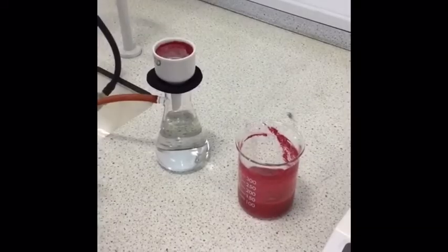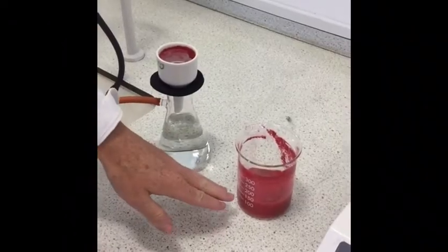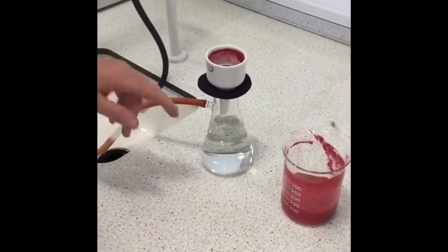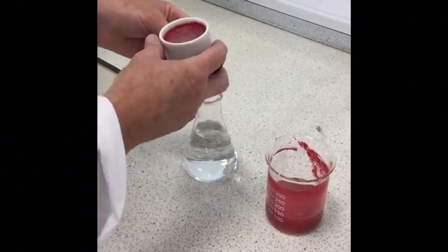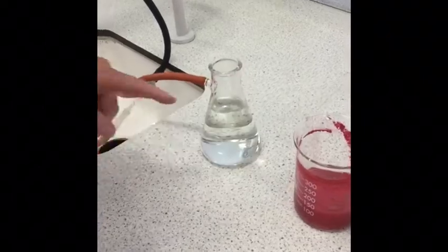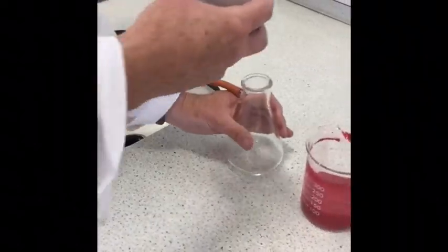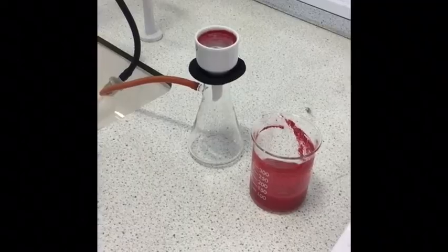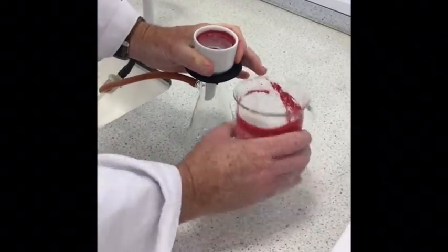Right, I've just stopped the filtration just now because I'm not going to be able to get all this solution into this flask before it's full up. So I've turned the tap off and removed the funnel, and then we're not interested in what's in here, so we can just pour that away. Put it back on, turn the tap on, and then continue filtering.